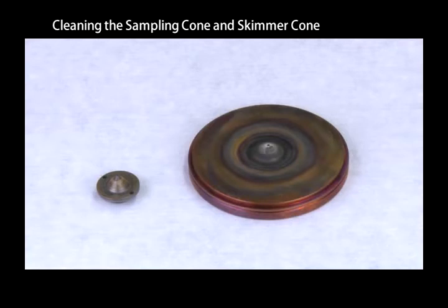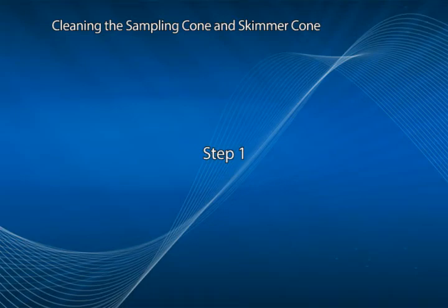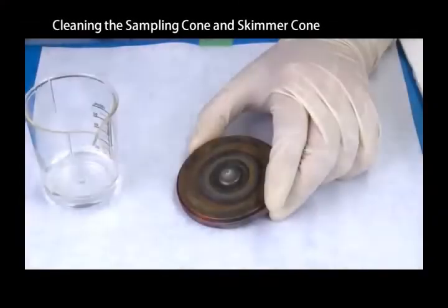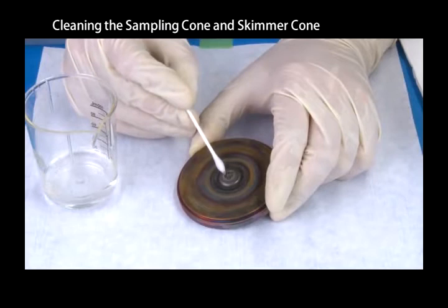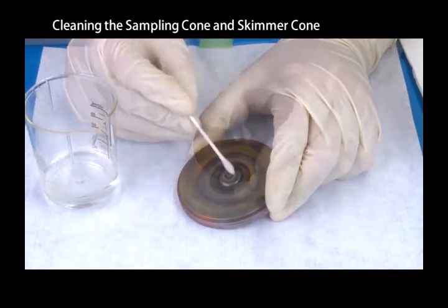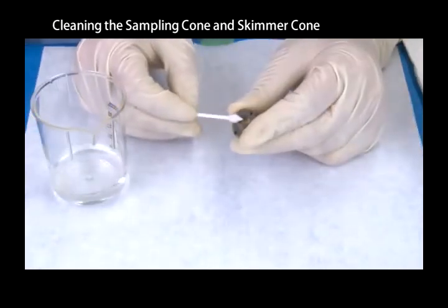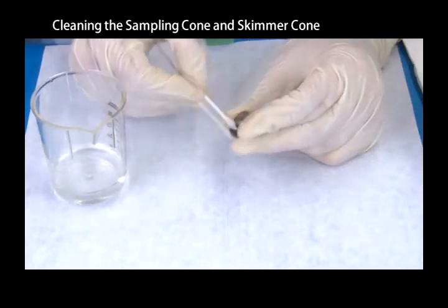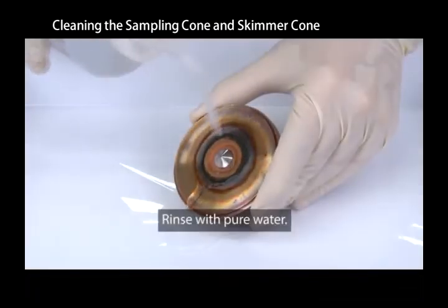Air dry the sampling and skimmer cones after cleaning. Use cotton swabs to clean the sampling and skimmer cones. Dip the cotton swab in pure water and lightly wipe both surfaces of the cones. Rinse with pure water.